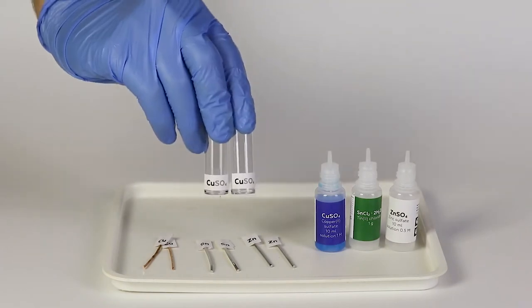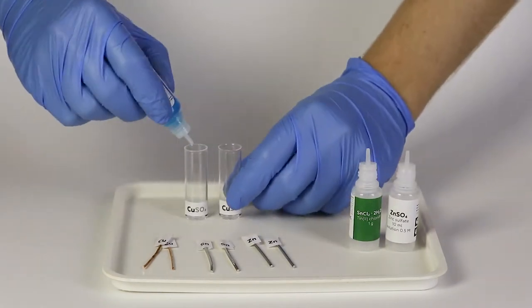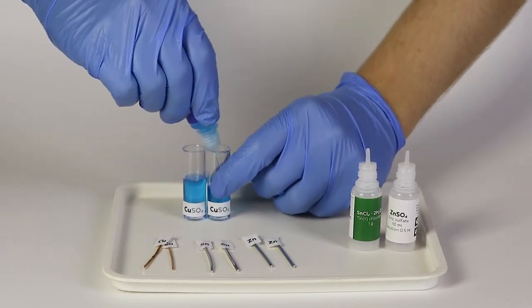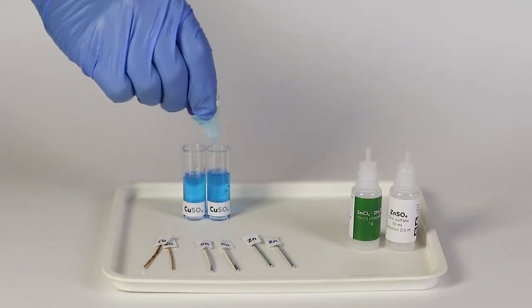Now take the solutions of copper sulfate and zinc sulfate. Fill each of the vials approximately half full with the corresponding solutions of copper sulfate and zinc sulfate.